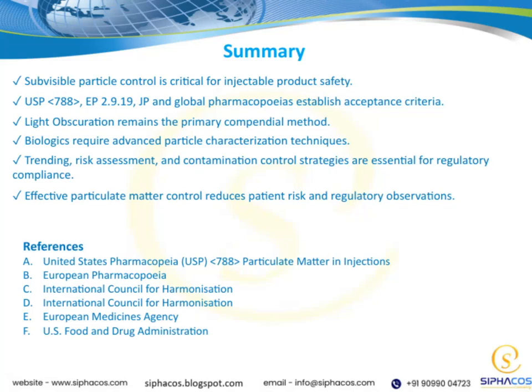To wrap up, we've seen that controlling subvisible particles is absolutely critical for the safety of injectable products. Various global standards, like USP, the European Pharmacopoeia, and others, set clear acceptance criteria we need to meet. Light obscuration remains the go-to method for measuring particles, but biologics demand more advanced techniques. Staying on top of trends, assessing risks, and implementing contamination controls aren't just best practices, they're essential for regulatory compliance. Ultimately, effective particle control protects patients and keeps regulators satisfied.